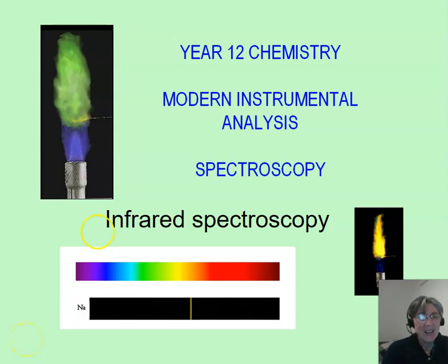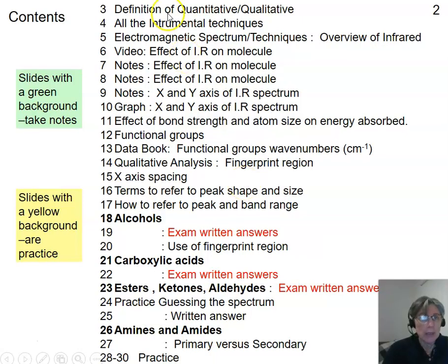Okay, this is to look at infrared spectroscopy. Spectroscopy, like microscope, telescope, uses light, and it's using a range of light. So these are the slides. When you get the PowerPoint, you can flick through and look at what you want to.